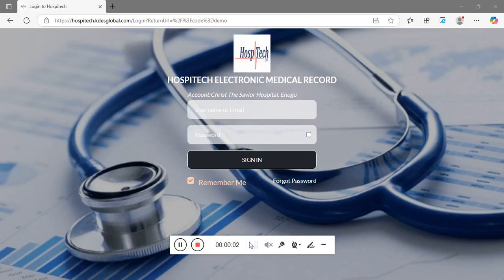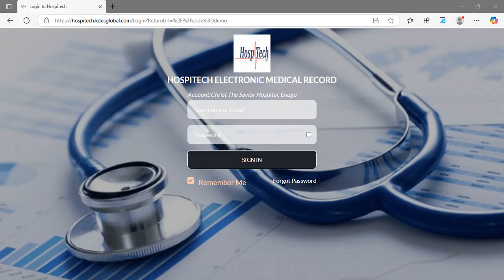Good day. In this video, we are going to look at how we can use Hospitech in a laboratory industry. We are going to be making use of two browsers for the super admin account, the cashier account, and the lab account, the laboratory account. So we are going to alternate with Firefox, but the super admin account will be the Microsoft Edge.